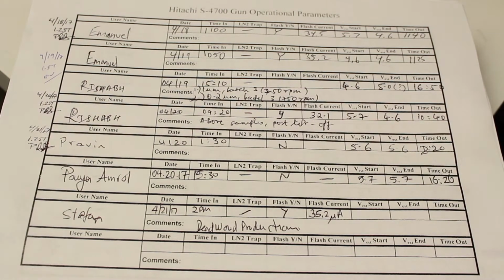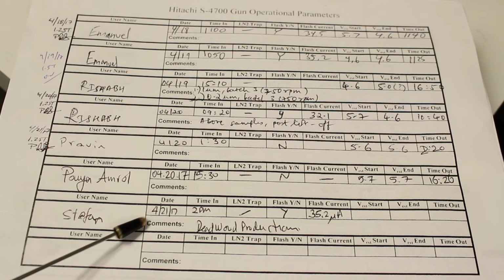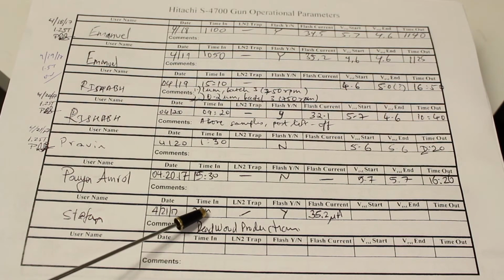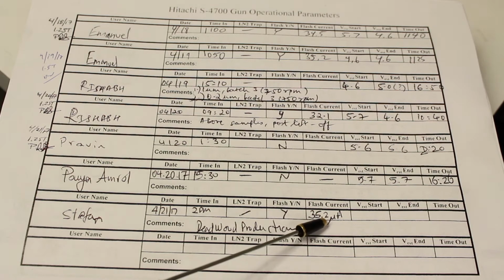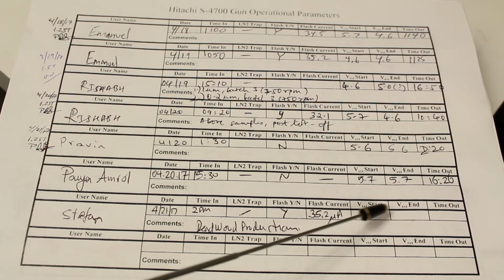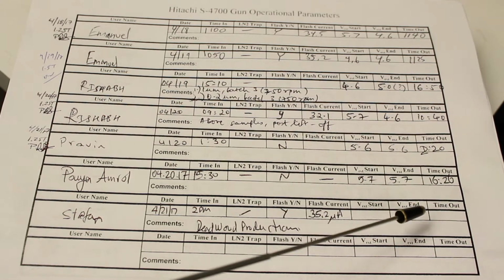Alright, the first thing you do is sign in the logbook. So put your name down legibly, the date, the time. We no longer use the liquid nitrogen trap. If you should happen to flash while you're using the tool, make a note of the flash current, the start and end extraction voltages, and then the timeout. You will enter these at the beginning of your session and at the end of your session.